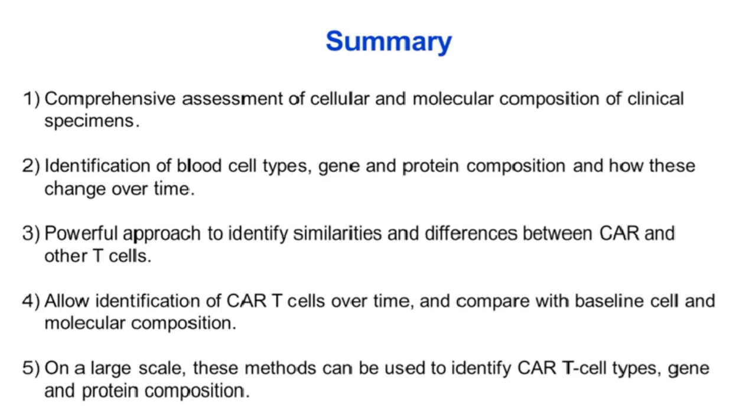This is a powerful approach, of course, to also identify differences of, in this case, engineered CAR T cells compared to the normal T cells that are in the blood, and ask questions, for instance, of how those cells interact. Do they interact at all? Do they share any signature? What can we do to improve CAR T cells to make them not look very different from the rest? And can they become memory cells? Are they looking the same?